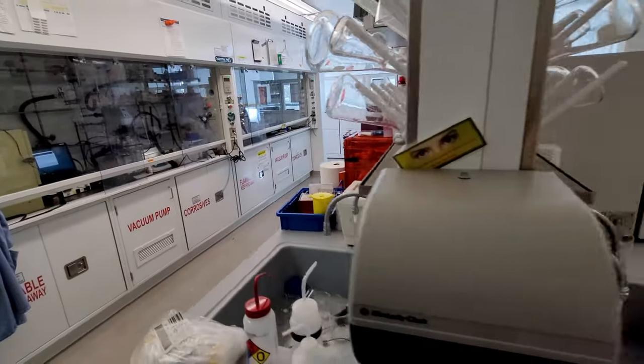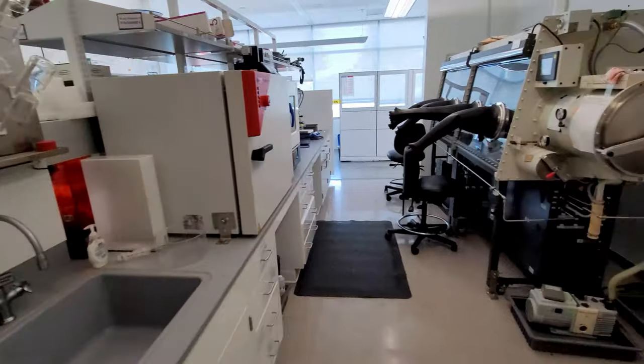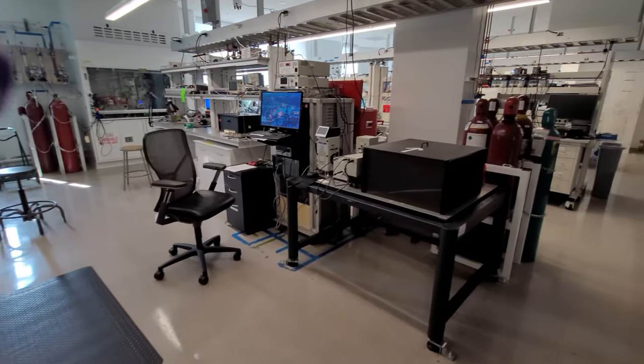Gloveboxes provide a clean and inert nitrogen atmosphere for synthesis, testing, and storage of water and oxygen-sensitive compounds.